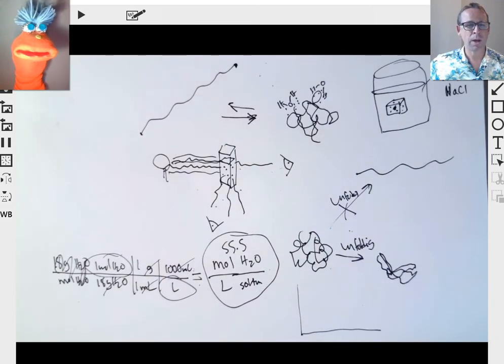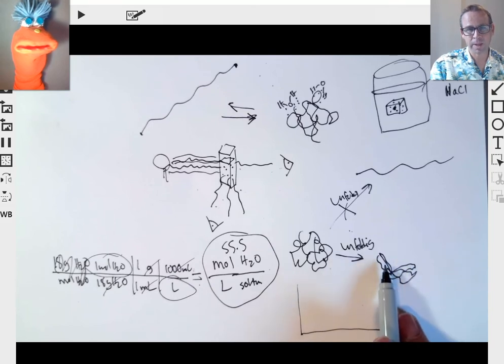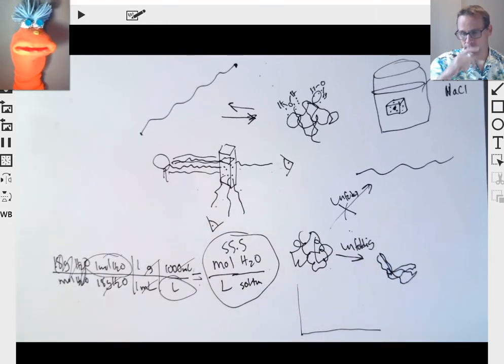What are some reasons why you might see a decrease in fluorescence when the protein unfolds? I'm not sure. I don't know if I can understand that one. Well, you could get a shift in such a way that the tryptophans actually get buried more, or the tryptophans come in closer proximity to other fluorescent molecules or other molecules that can absorb the light, the electromagnetic energy that the tryptophans are fluorescing.